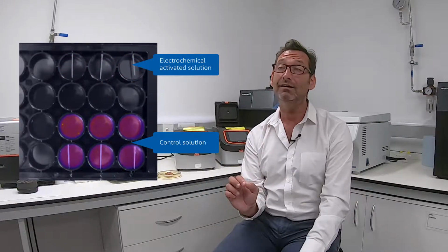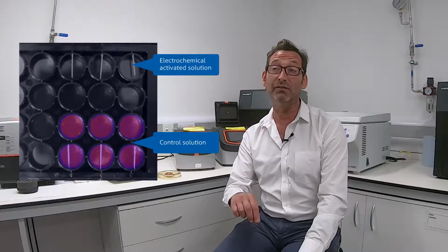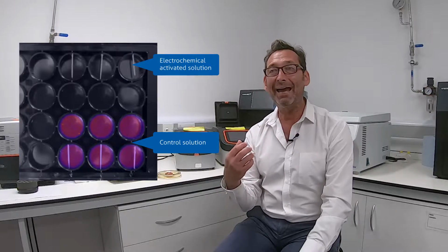And what we're able to do with bioluminescence is to demonstrate this very visually. So I explained earlier about bacteria glowing and being alive. Well, what we can do with our experiments or in our facility is treat those bioluminescent bacteria with a disinfectant, such as electrochemically activated solutions, and we can actually visually watch the lights go out, which would imply that the bacteria is either metabolically inactive or hopefully dead. What's even more interesting is that we can keep our low light cameras that detect this bioluminescence rolling. So what usefulness is that?